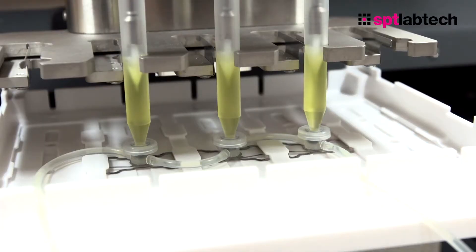Viscous liquids can also be pumped through the Auto Feed Reservoir system. Recently we had an example where we actually used heated agar to get it to a liquid form and then automatically aspirate and dispense with the Dragonfly Discovery.